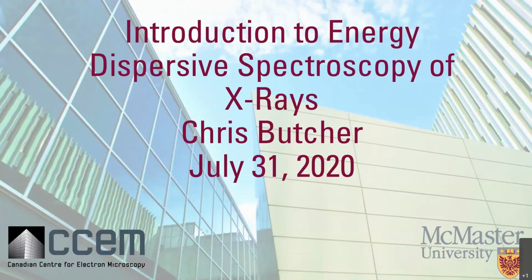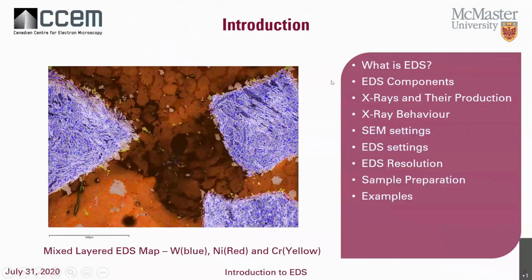Today, we're going to be talking about energy dispersive spectroscopy of X-rays. It's a technique used both in SEM and in TEM. Today, we're going to be covering what is EDS, also the components of the EDS detection system, how X-rays are produced and the nature of the X-rays.